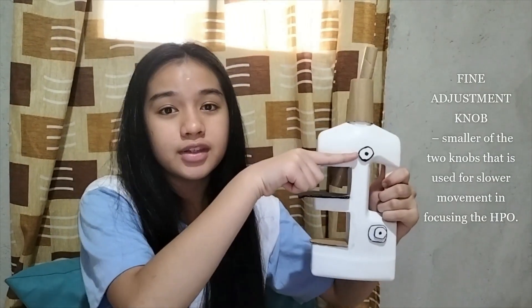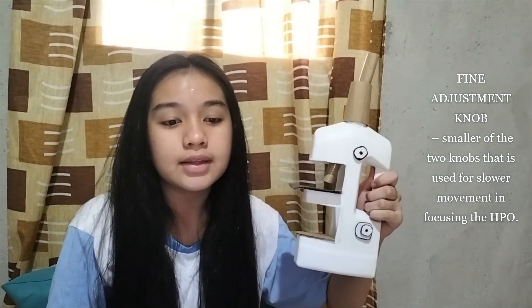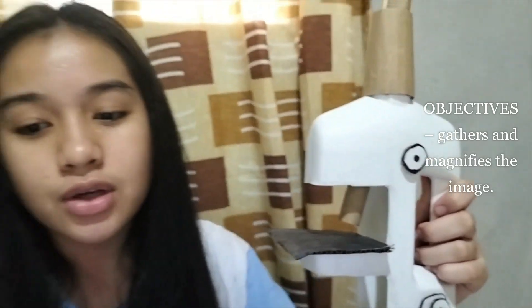This one is called the fine adjustment knob. It is the smaller of the two knobs, used for slower movement and focusing the HPO. This is the objective — it gathers and magnifies the image. Often there are three objectives.